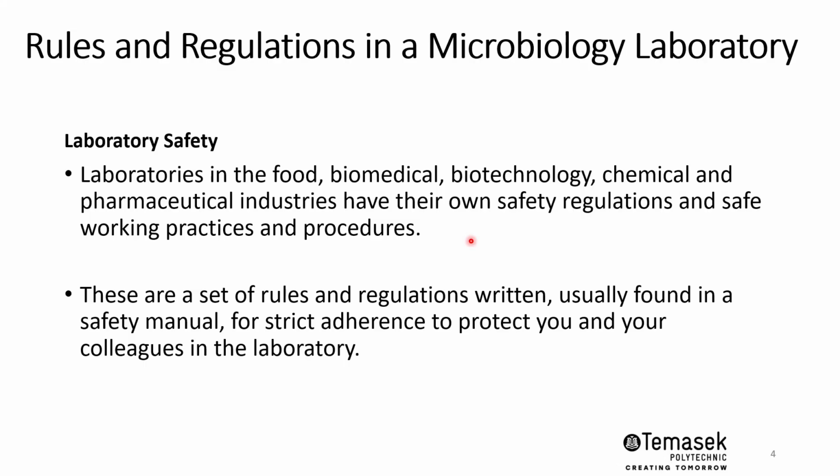So when you are heading out for your internship, you can expect their own safety regulations to be communicated to you. Laboratory safety is also a set of written rules and regulations, usually in a safety manual, to protect you as well as your colleagues and the people working in the laboratory. Often you will need to adhere to them strictly to avoid any injuries, and hopefully we don't have any death arising from this.